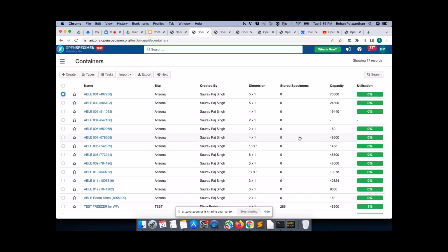Yeah. Within a -80, we would end up restricting. We wouldn't put Dewar samples in there, and Dewar samples would go in the Dewar. So PBMCs would go in the Dewar. And then there was something else. Oh yeah, we'll assign a range of boxes to a particular study to be filled.